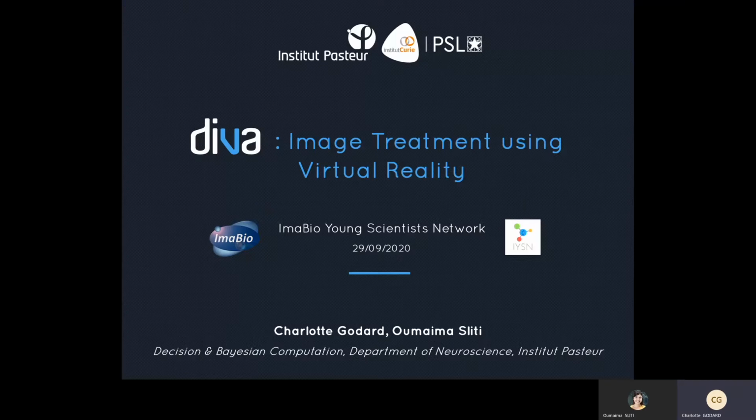Okay, so hello everyone. Oumaima and myself are research engineers at the group Decision and Bayesian Computation at the Institut Pasteur. So we are going to present you the software DIVA for image treatment using virtual reality.